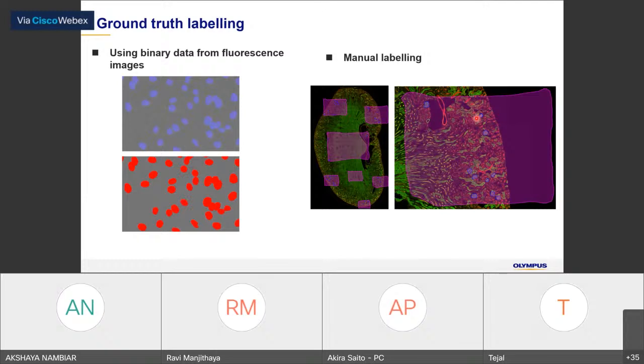And also, for example, if you have a fluorescence image and also a bright field image together for the training image, you can use the fluorescence image to give the ground truth. So these are the ground truths of the nuclei, and then you just apply the inference to the bright field image, and it will give the probability map, even if there is no DAPI staining.